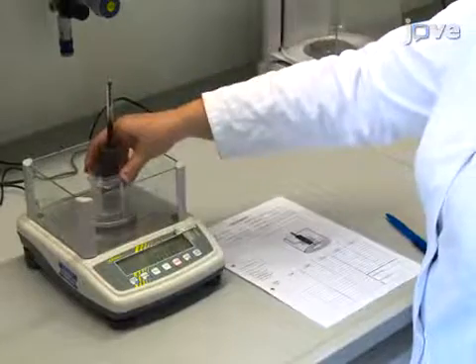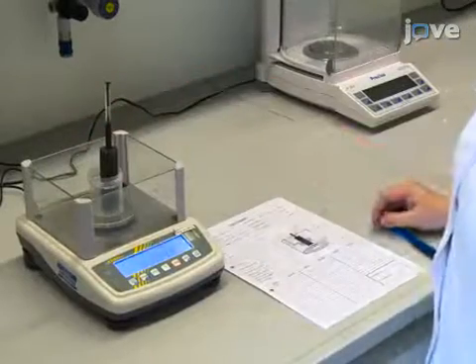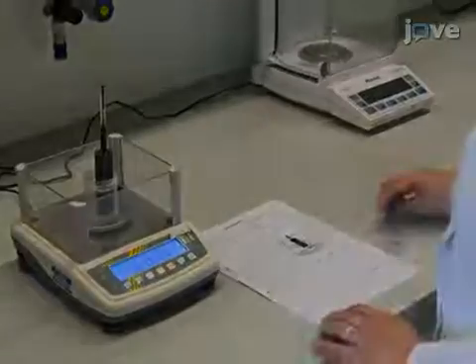Then, weigh the whole setup with a scale and note the value to determine the amount of tin consumed during the reaction.